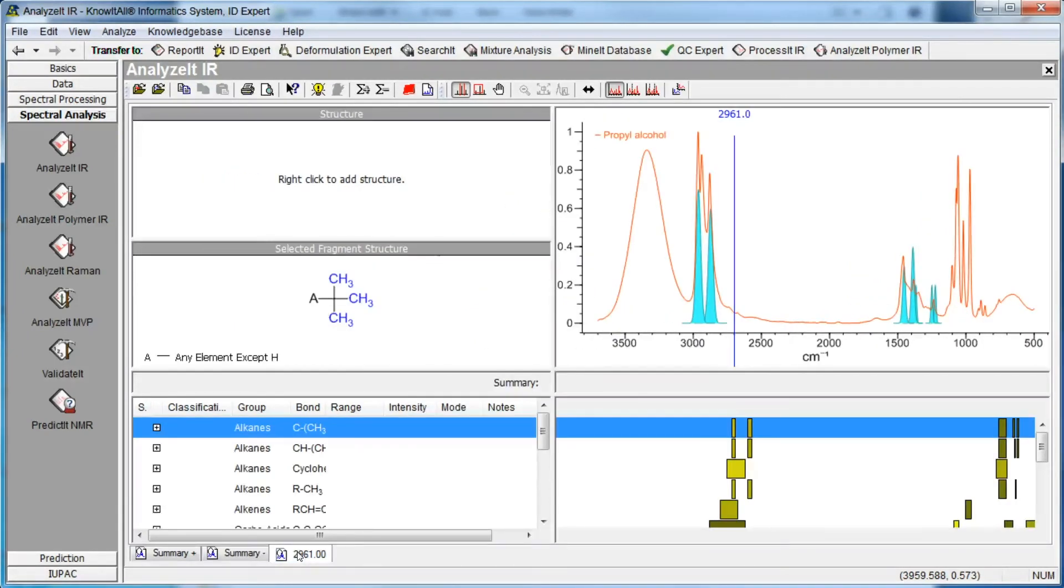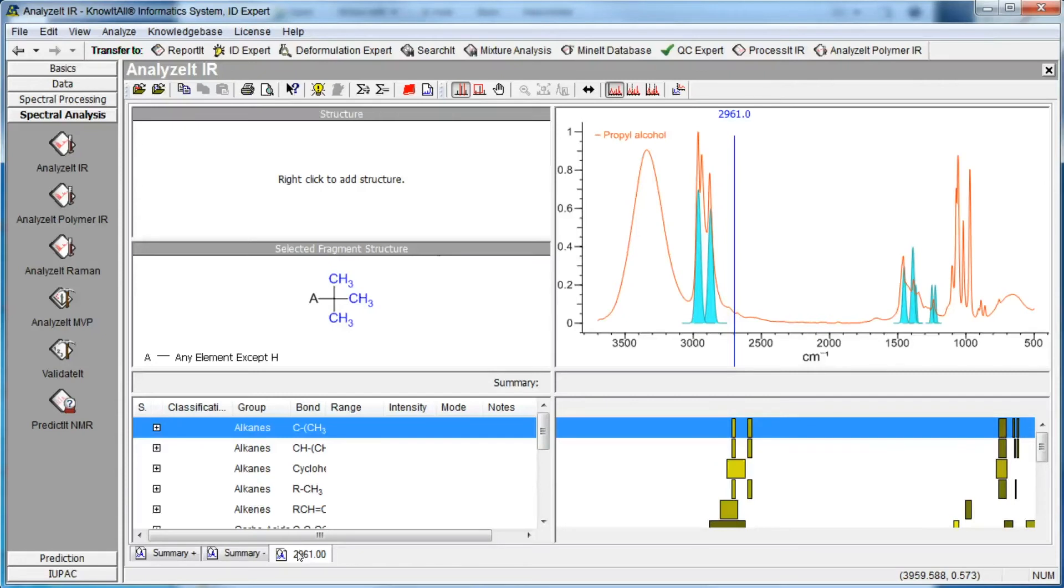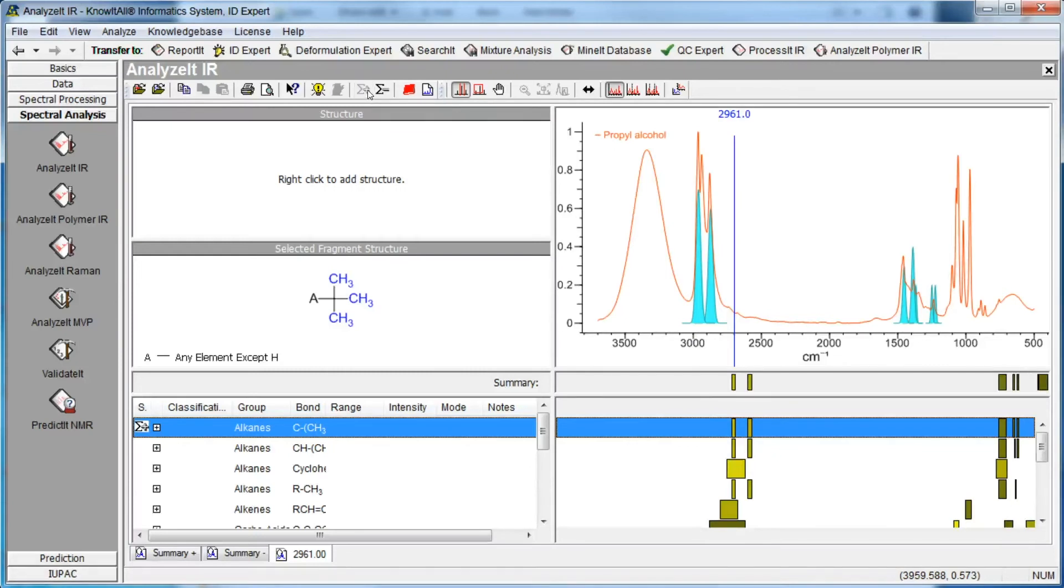In this example, the methyl group correlates well with our spectrum. We can select it, then copy the information to the Summary Plus tab by clicking the Toolbar button. A Summary Plus symbol now appears in the functional group data pane next to this group.